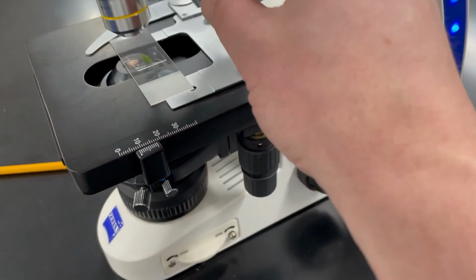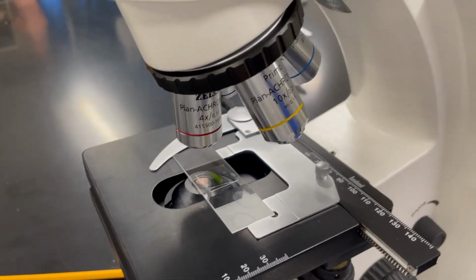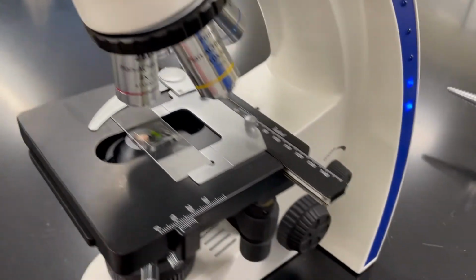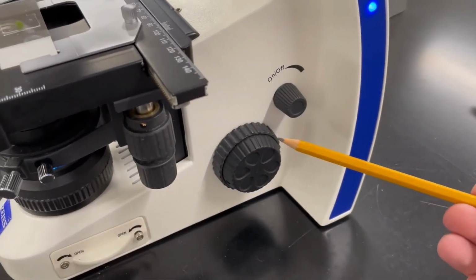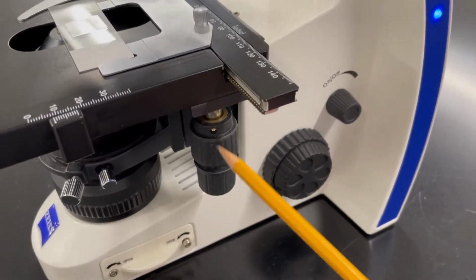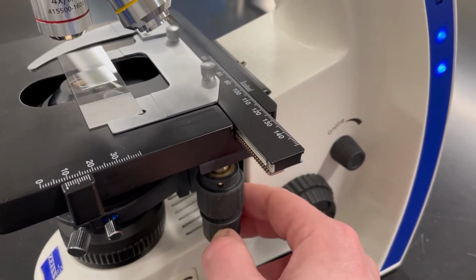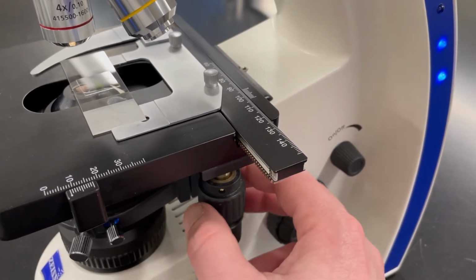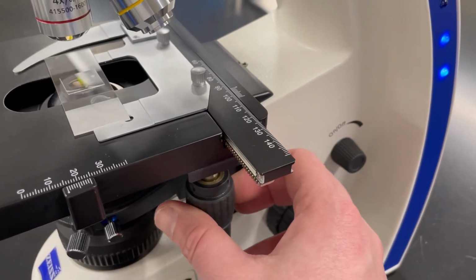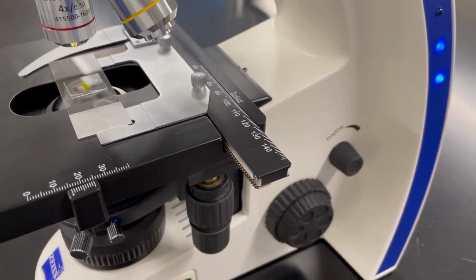So in order to focus, what I'm going to do is I'm going to put this actually at the lowest lens here, and this leads us to these knobs here and these knobs here. So these knobs here are actually the stage adjust knobs. So watch what happens to my slide when I turn these. So one of them moves the slide horizontally, the other moves it up and down. So the whole idea here is to center the specimen basically on the light source.